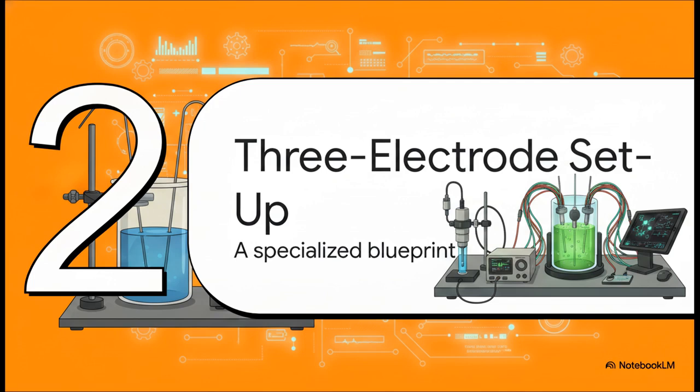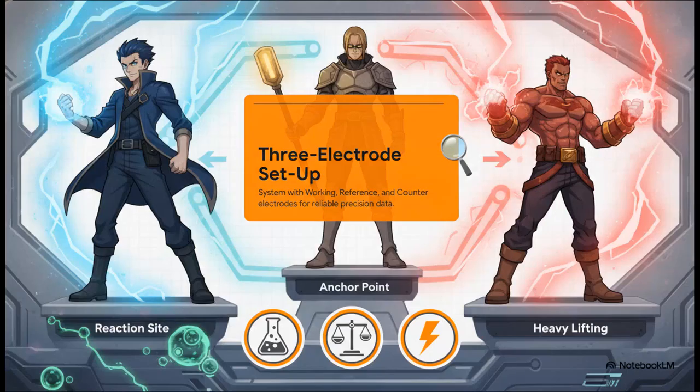Moving right along to part 2, the three-electrode setup. Taking all of this from the theoretical textbook to the modern lab bench requires a highly specialized blueprint. That two-beaker setup we just talked about, great for a textbook, but for high-precision analytical work, we need something vastly superior. Enter the three-electrode setup. We use 3 distinct players here for a very good reason. We need one specific site for our reaction of interest, a steadfast anchor to measure against, and a third component to handle the electrical heavy lifting. Trying to measure highly precise potentials while simultaneously passing a massive current through the exact same measuring stick? Yeah, that simply doesn't work.